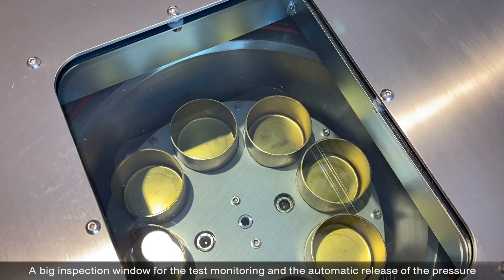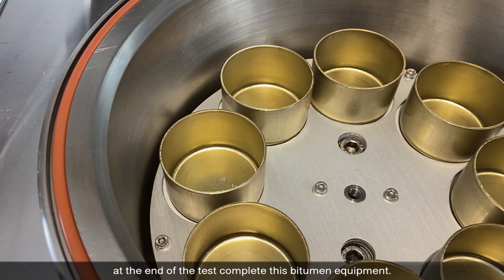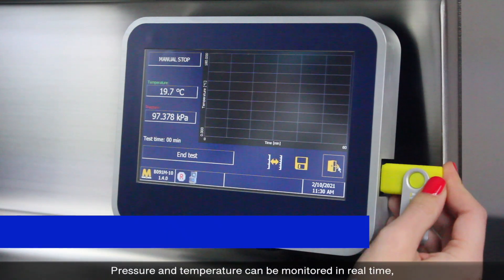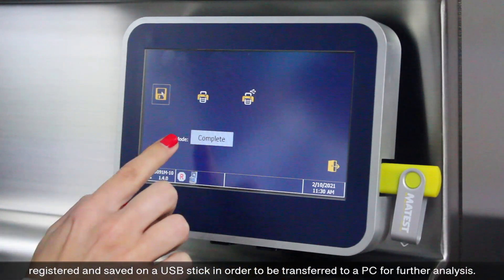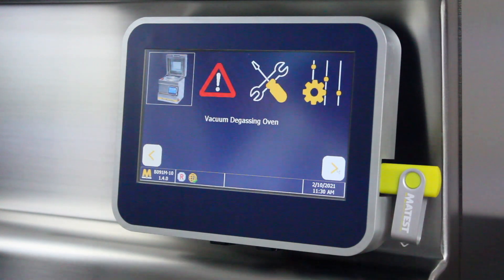A large inspection window for test monitoring and the automatic release of pressure at the end of the test complete this bitumen equipment. Pressure and temperature can be monitored in real time, registered and saved on a USB stick in order to be transferred to a PC for further analysis.